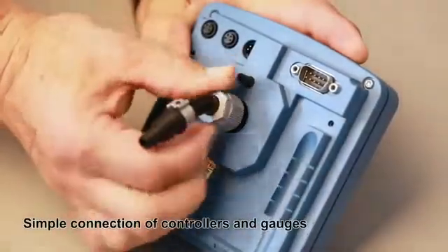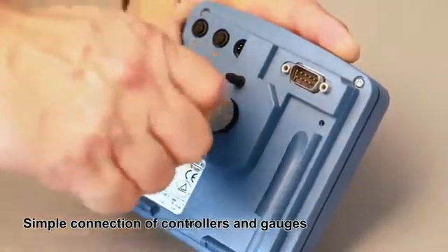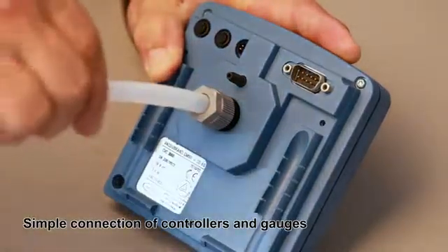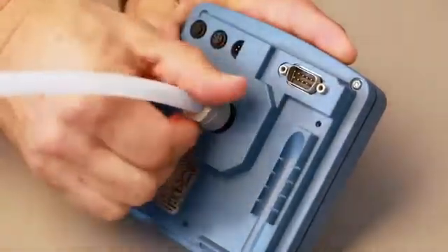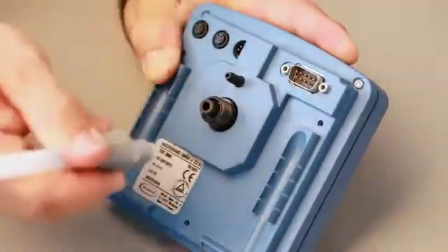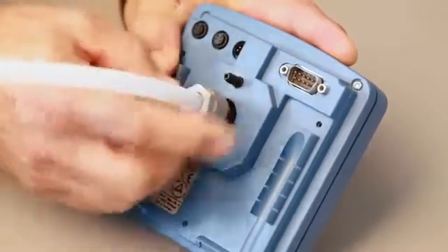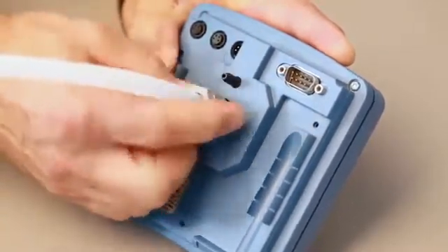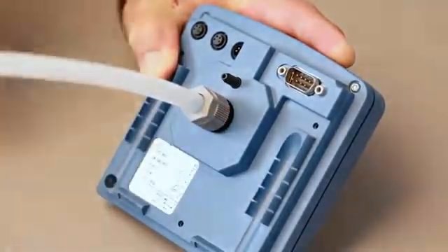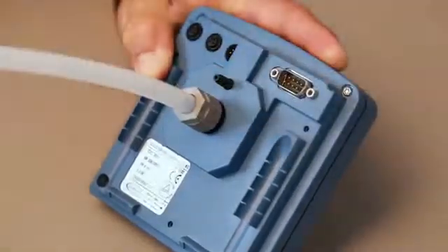Controllers and gauges are connected the same way. The electrical connections between valves, controllers, and measuring instruments are made with VacuBus connections. Distances of up to 30 meters can be bridged. No bending, welding, or soldering is required. A vacuum network is constructed quickly and very easily. The leak tightness of the system can be checked using a gauge and a VacuBrand vacuum pump.